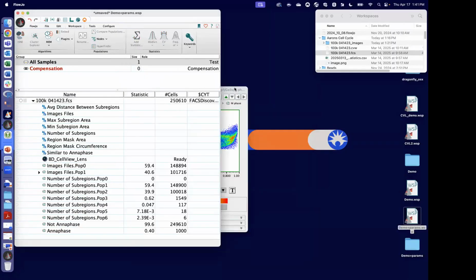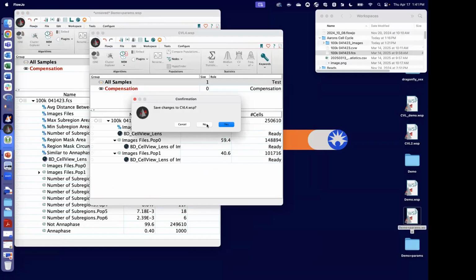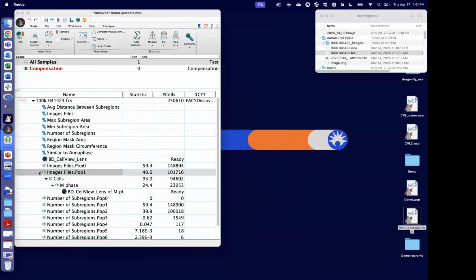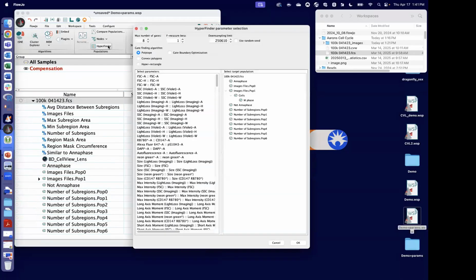It is thinking of the other workspace, I think. Let's make sure I've closed that then. This didn't really need that guy anyway. Okay, I'll make sure that it knows those are there. Yay. Okay, cool. One more time.